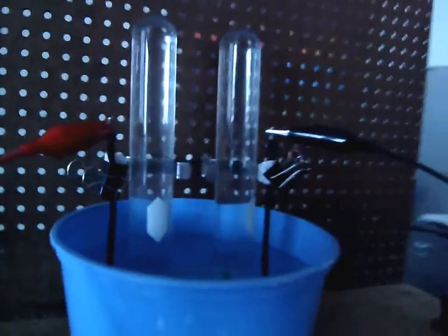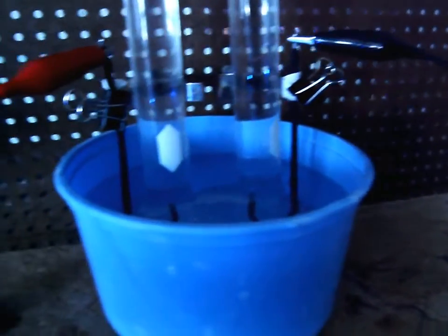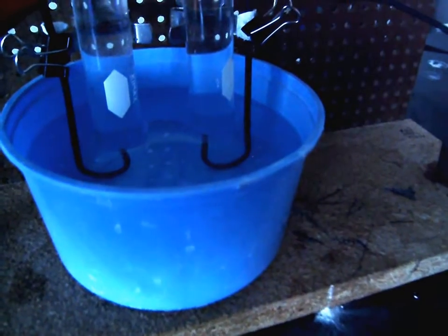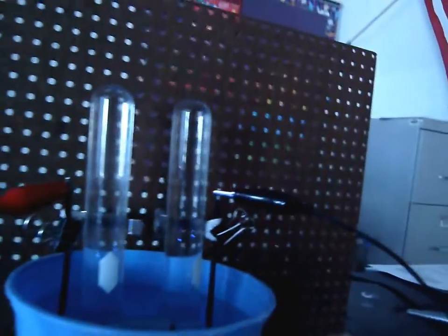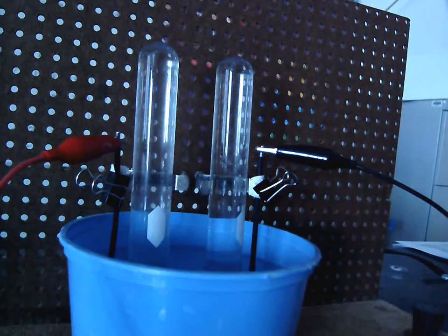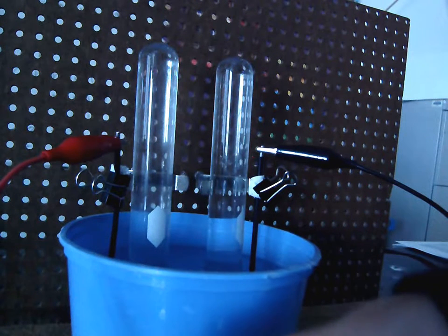So let me see if you can tell a little bit better now that I've explained kind of what's happening. So there's 2 electrodes, one for each test tube, and the very tip of the electrode is directly under the opening of the test tube. And I wonder if it would help to have a little bit of light. Sometimes the light creates a really bad glare that makes it hard to see these when we have clear test tubes and clear water. So let me see if I can get a light on real quick and if that'll make a difference.